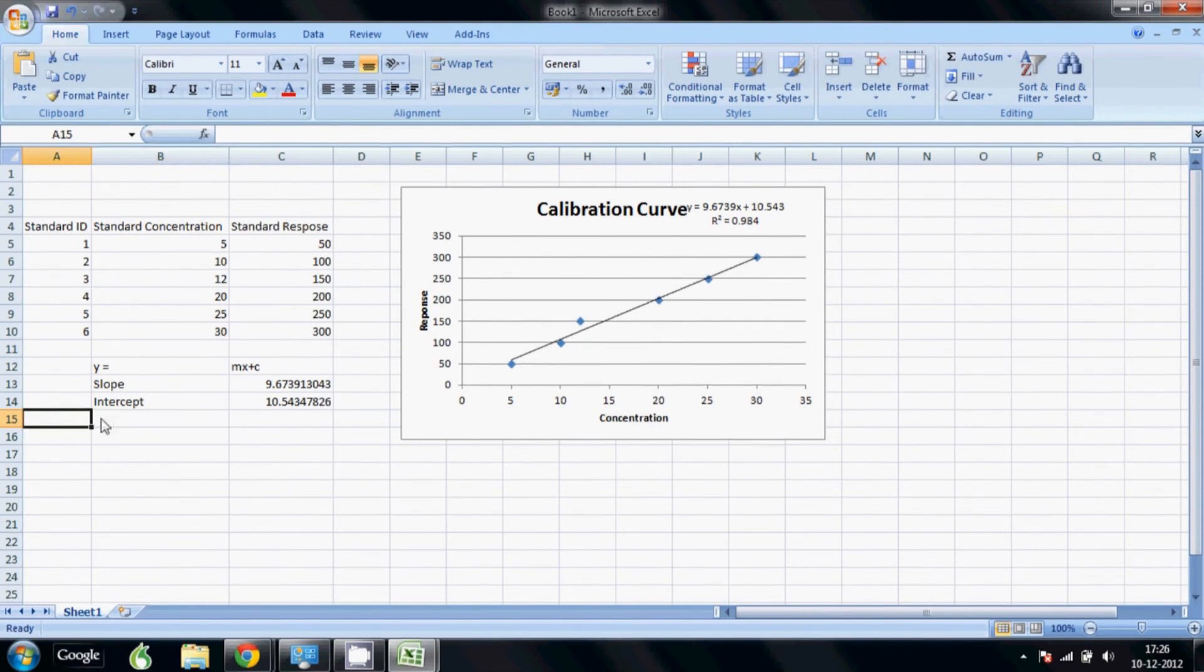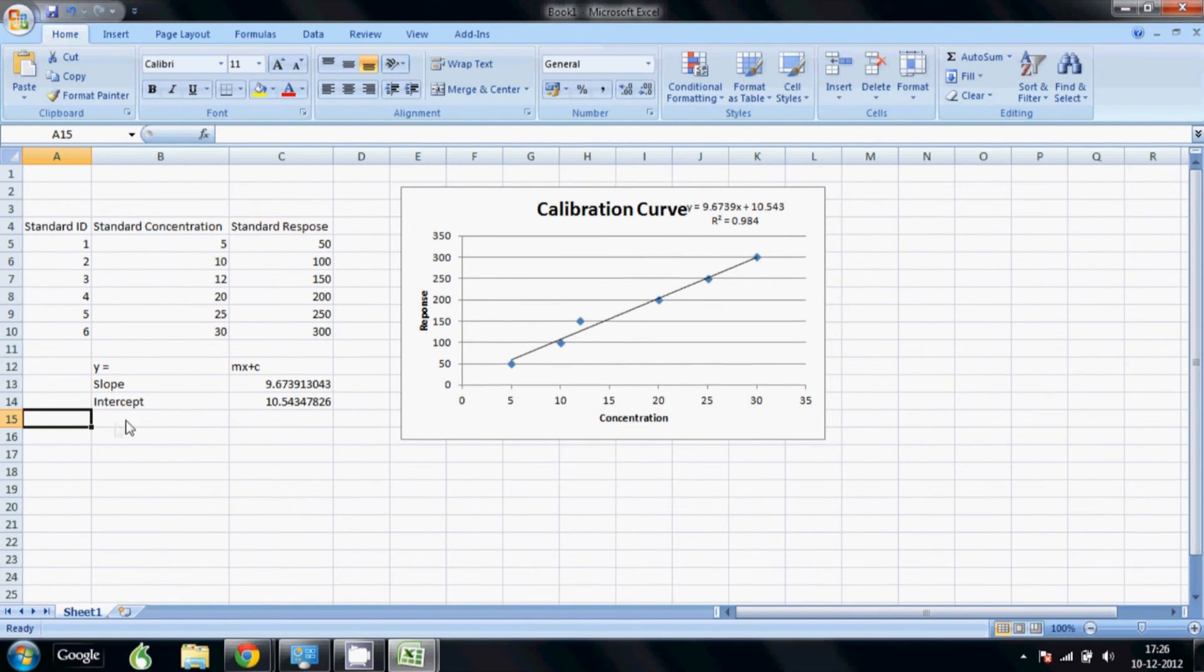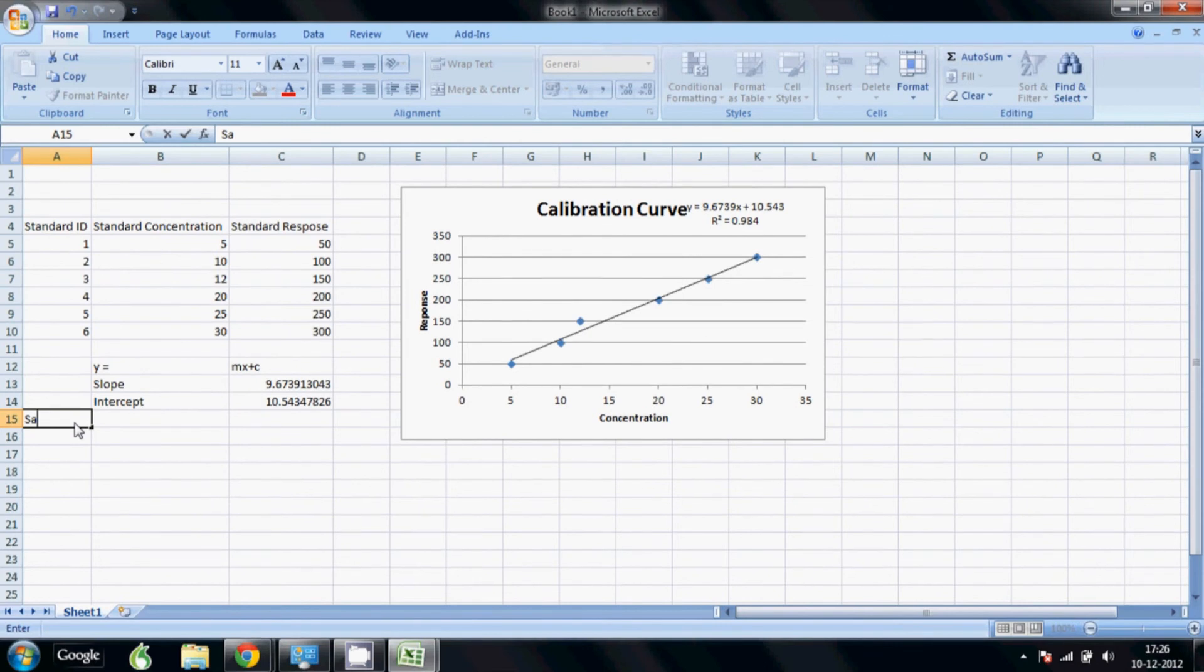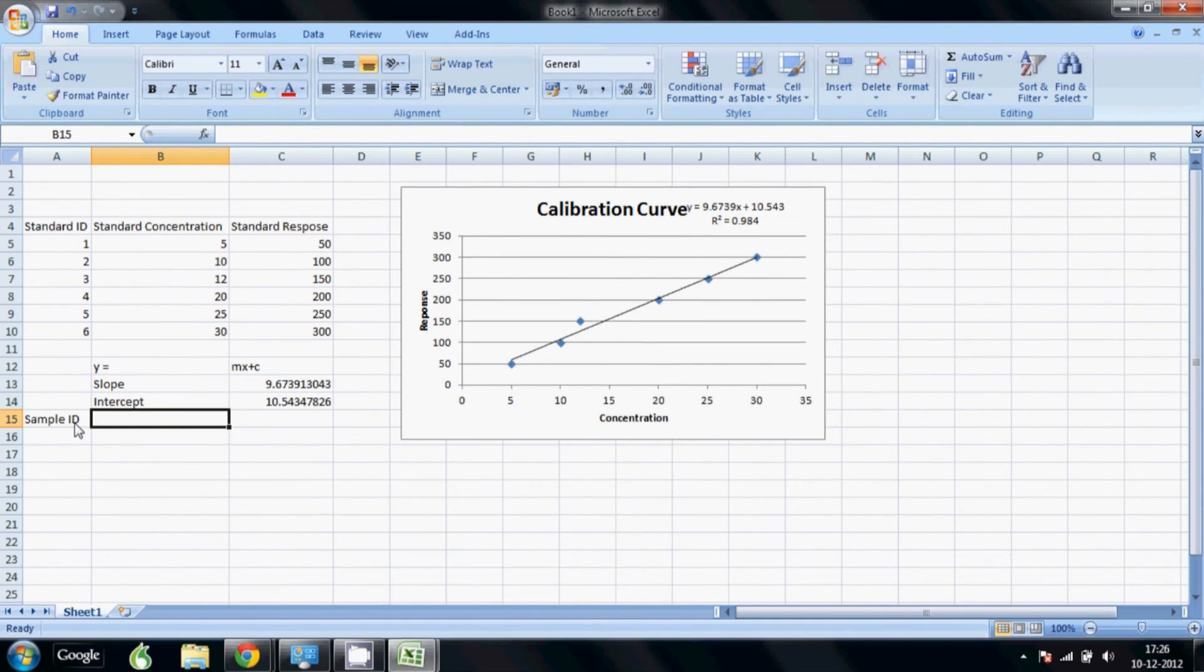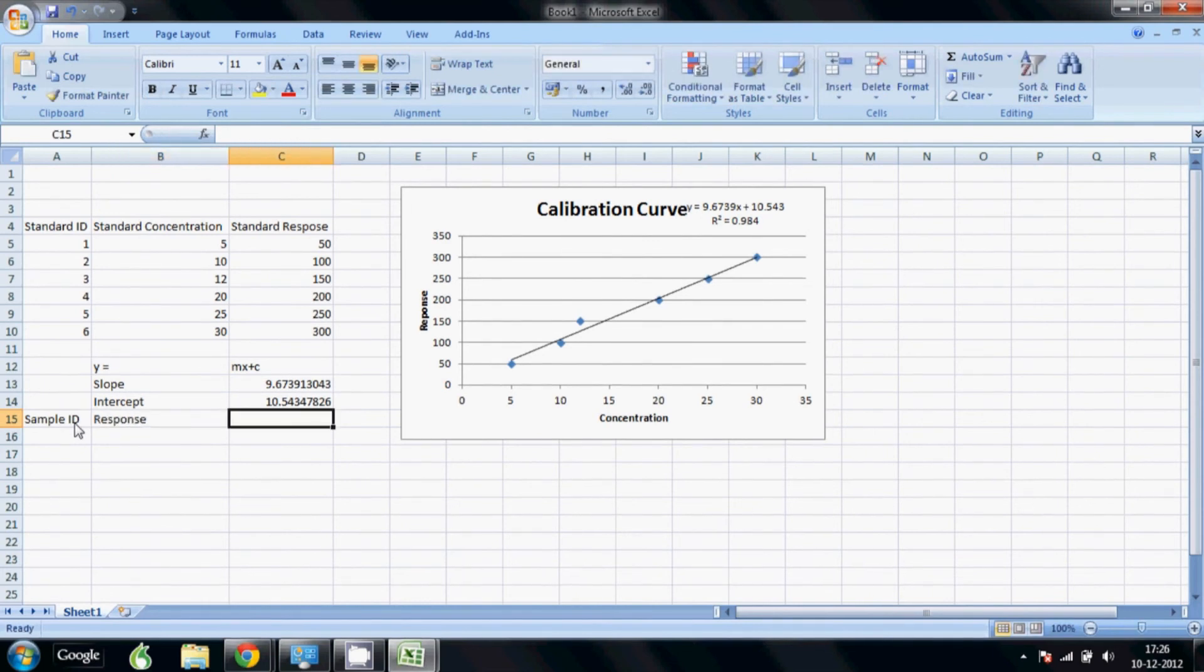Within this range of 50 to 300 in this case, or anything in your sample. So we will quickly make area for calculation here. So we put sample ID and we put response and we put concentration here. Let's see, we want to have six samples in this.